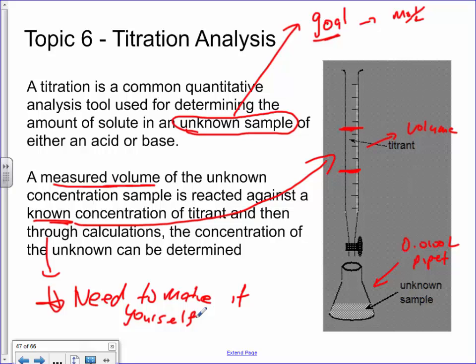What happens to water slowly over time? Yeah. Which means that if water has the ability to evaporate, granted it's slowly, right? That means that the volume of solvent is changing. It means your concentration changes. So even if I tell you that it's 0.5 moles per liter, it can actually change its concentration overnight just due to slight evaporation properties of water. Does that make sense?